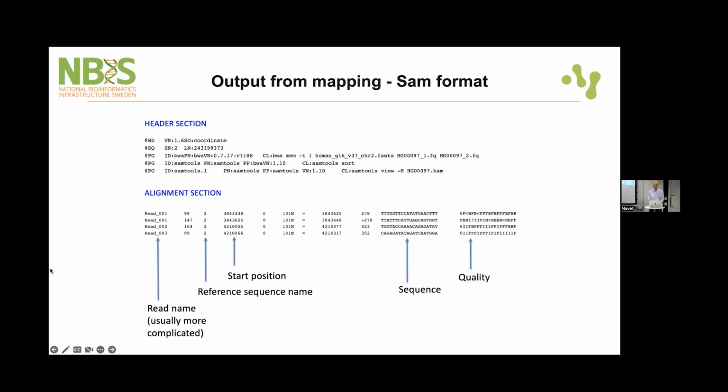Just like the FASTQ files that we looked at yesterday, the SAM formatted file contains all of your reads. However, it has a very different format. You no longer need to keep two files for a single sample for the first and second read. All the reads will be in the same file. The file has a header section at the top with general information about the sequencing experiment and the aligner and the settings used.